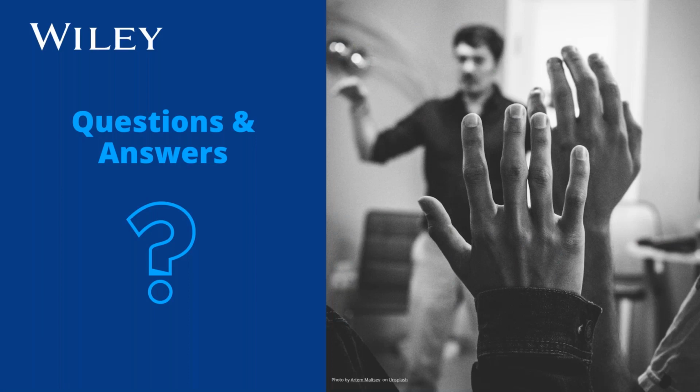Maybe we'll sneak one more in here. Can multiple or variable eV ionization be utilized in this software? That right now is no. Yes and no. It depends on how you store the data and then analyze the data. So it's not as simple as just a one eV situation. Thank you, Michelle, for that.